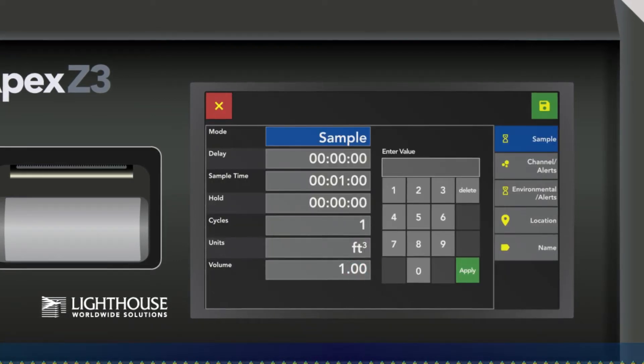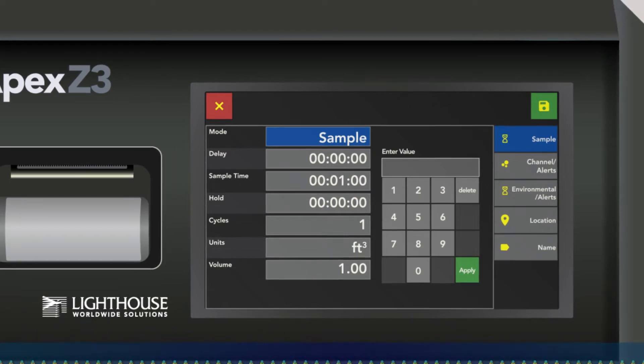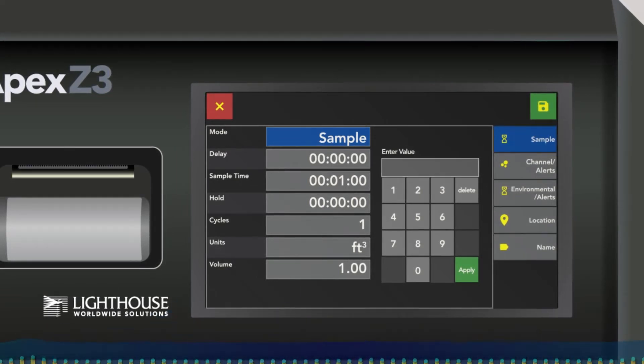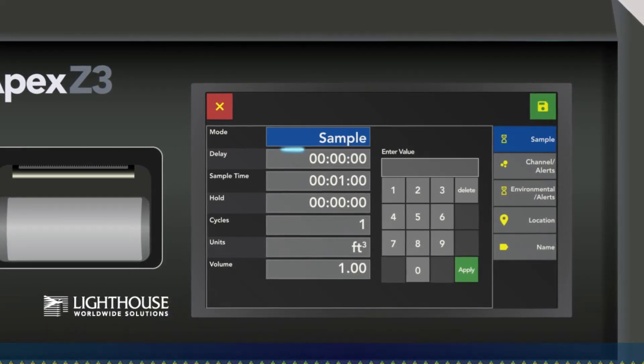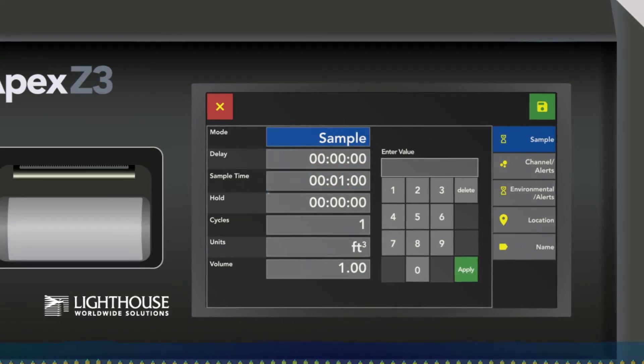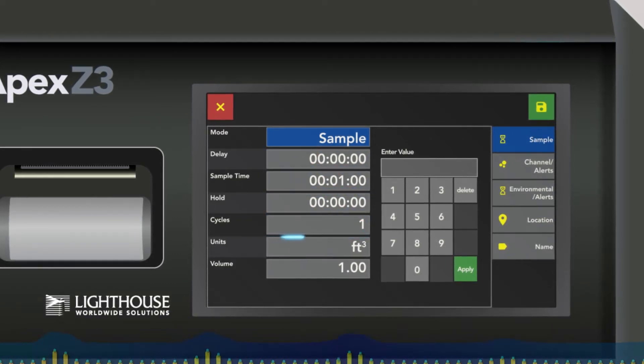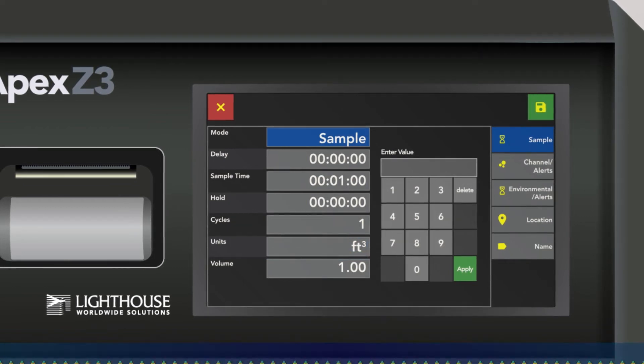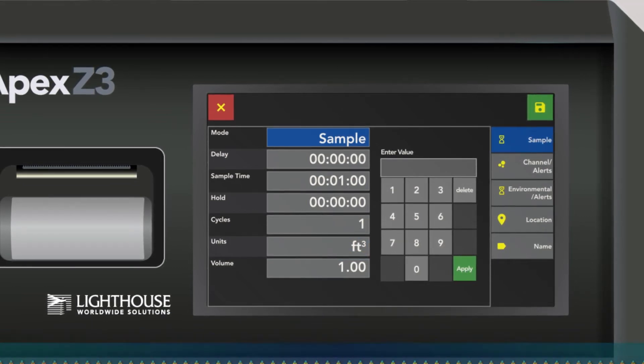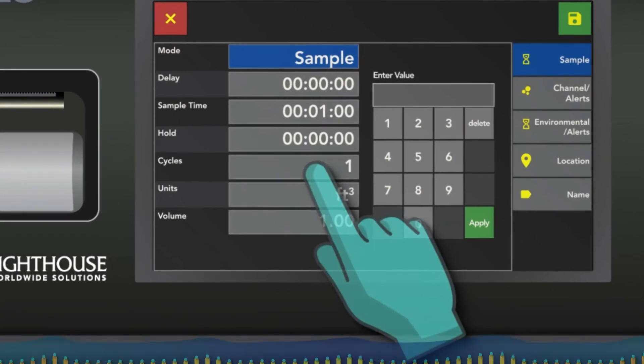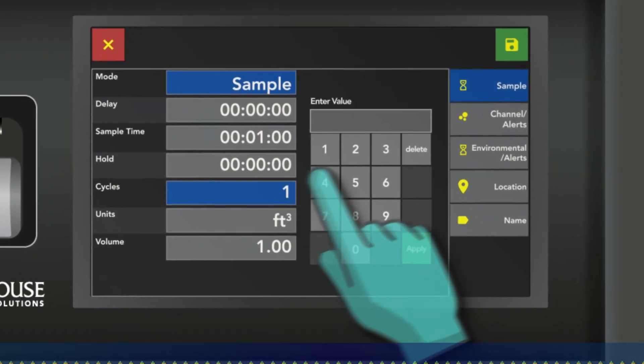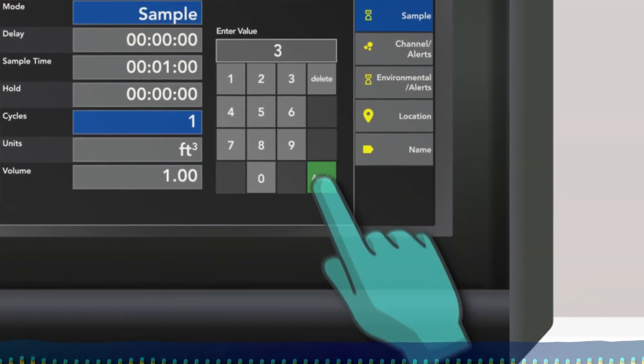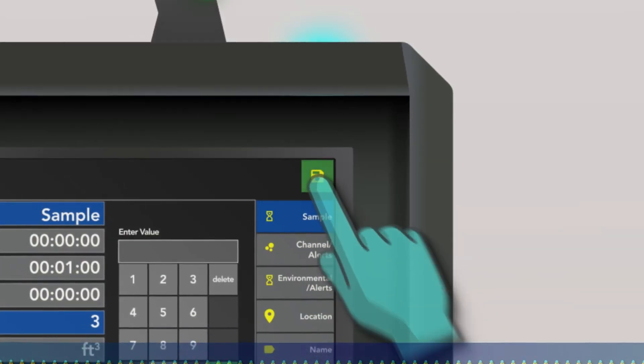Here you're presented with a simple screen where you can put in your delay, sample time, hold time, your number of cycles, and units of measurement. We'll just leave it as a one-minute sample, but we're going to go ahead and do three cycles. Simply press Apply, then Save, and you're done.